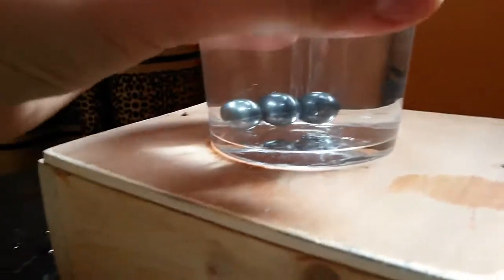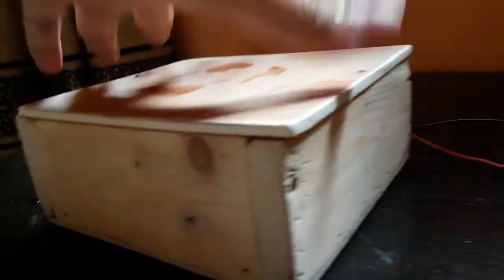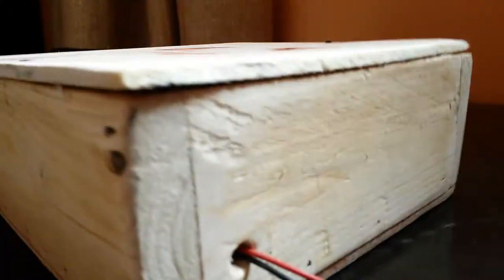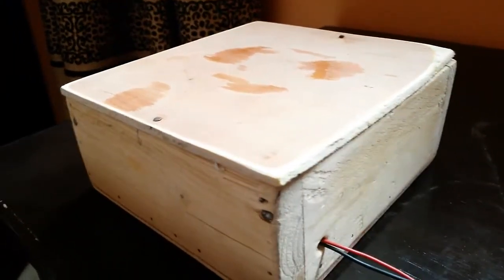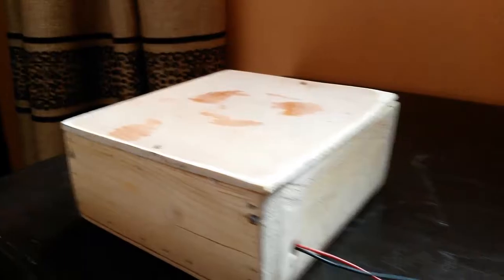Also, to take out the wires I drilled two small holes at the side, and from there I can route the wires out. So that's it folks — this is how to make your own lab stirrer. It doesn't cost much and it's a fun and easy project to build. Goodbye!